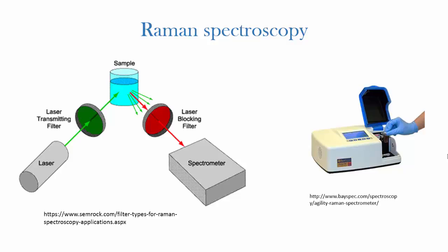You will notice that we do not specify each peak for the Raman as we do for the IR, and it is for this exact reason, as the Raman does not show very well the polar bonds, which a lot of our analgesics have, and it will only show the carbon to carbon bonds, so we only show how much of it matches. We analysed 3 unknown analgesics using IR and Raman spectroscopy and compared them to known analgesics and identified the contaminants and adulterants.